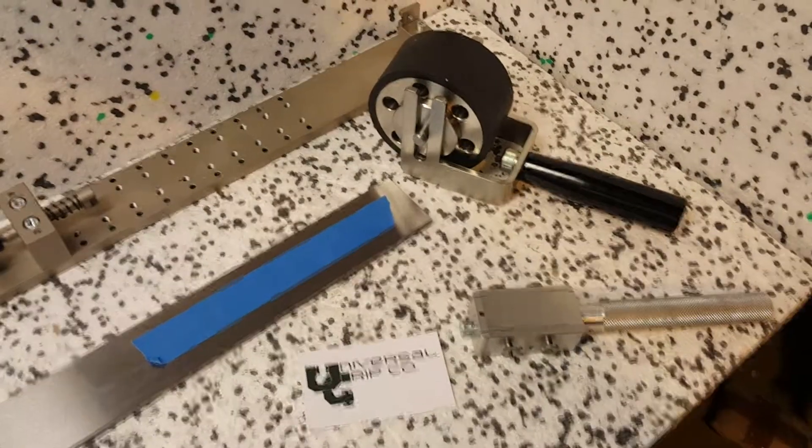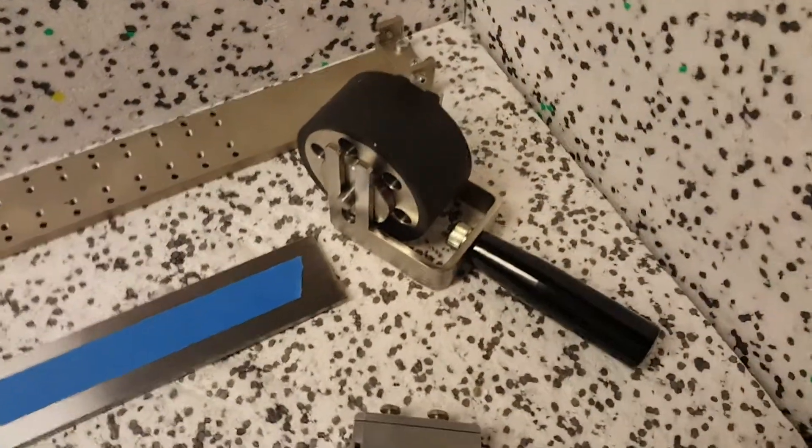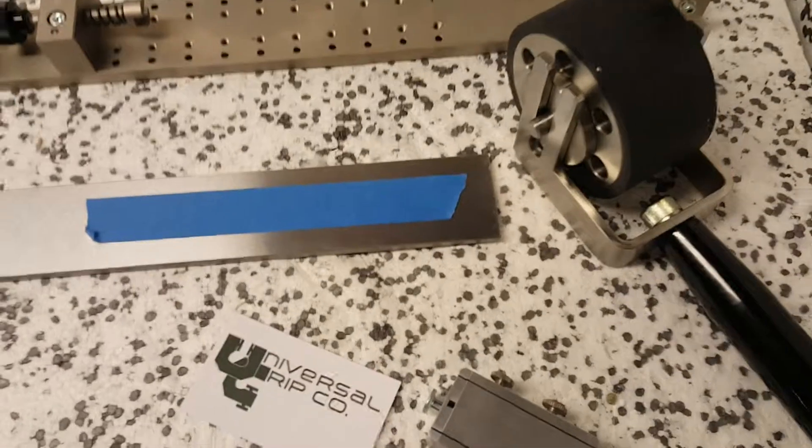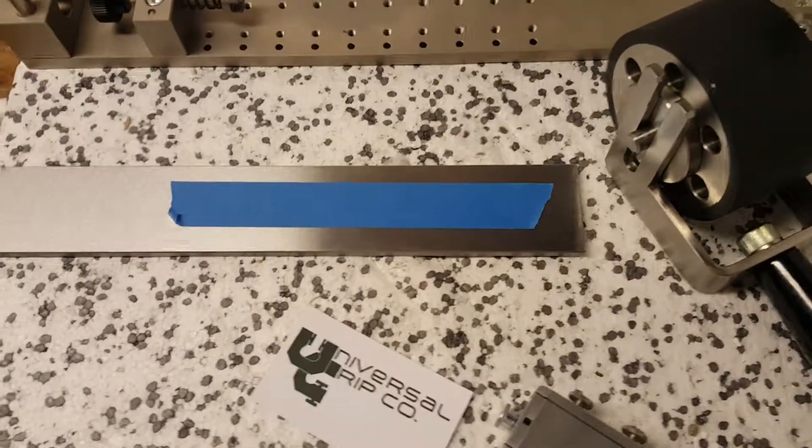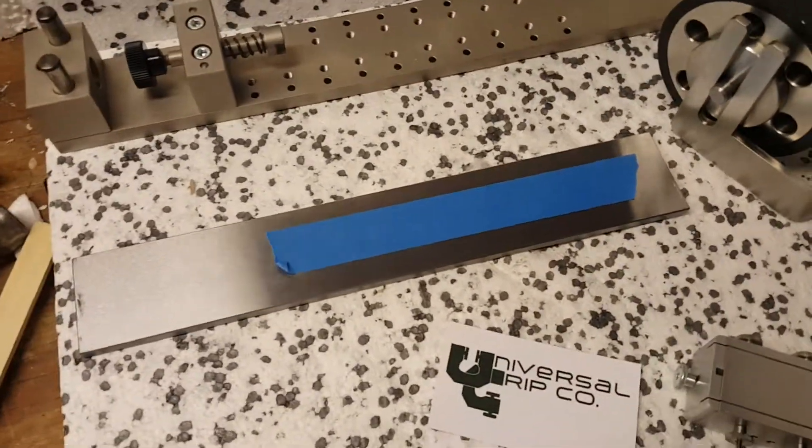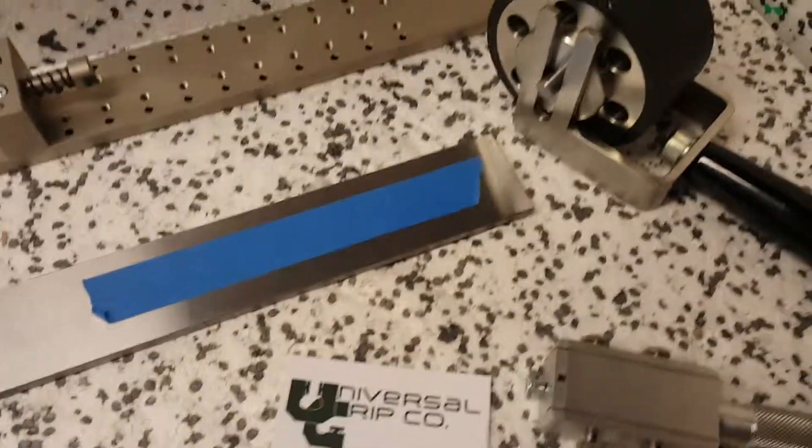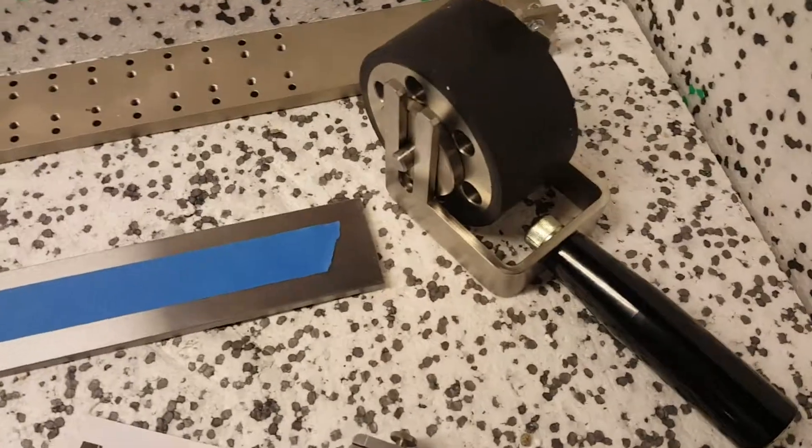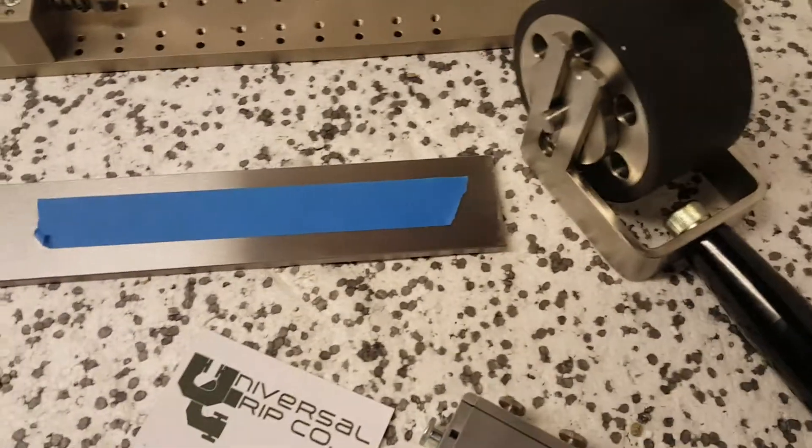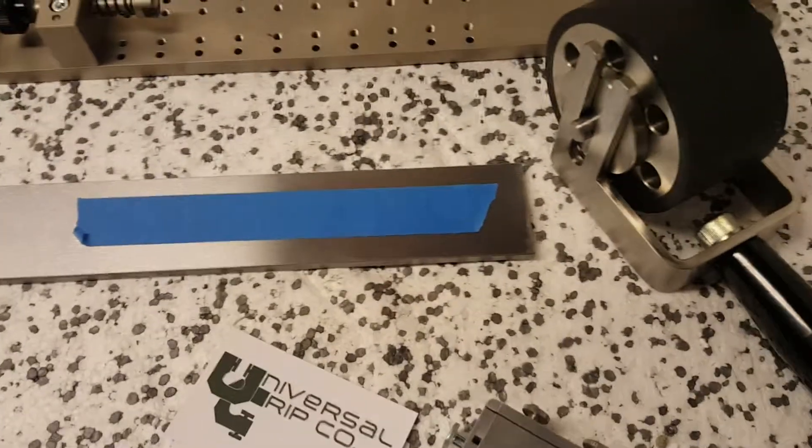Hello everyone, today we're showing our weighted roller for applying pressure-sensitive adhesive tapes to a substrate such as steel or glass. ASTM D3330 requires that you apply the tape at an even force, so you don't want to be pushing it down with your fingers unevenly. That's why we supply the weighted roller.